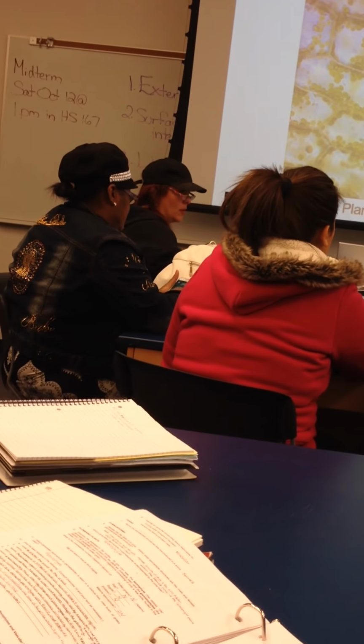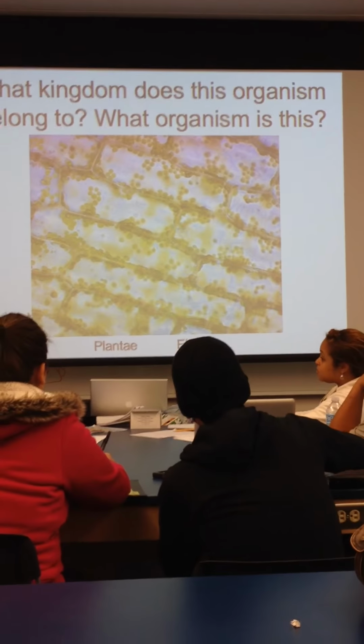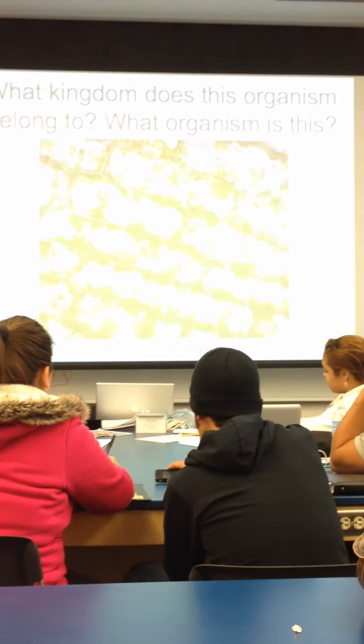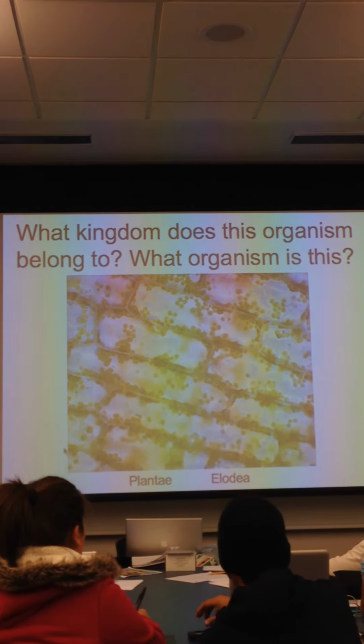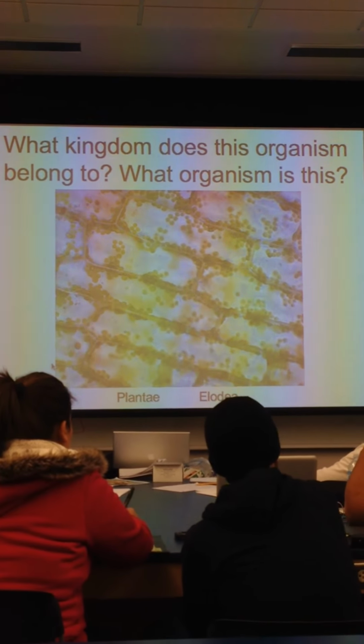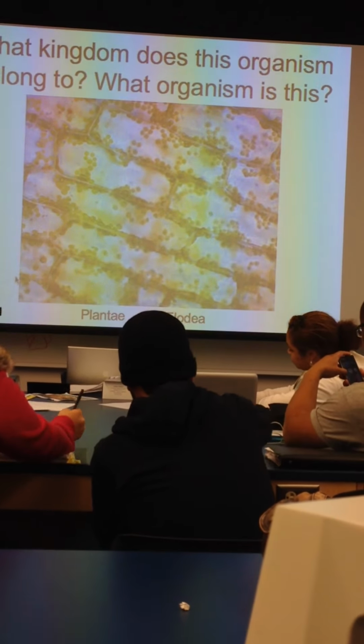Is everyone good? Can I switch it? Yes. Do we have to identify that this is in video or just... No. Okay. What you will have to know is that this is a plant cell. So it'll ask, what kingdom does this belong to? Okay? Okay, I'm switching.